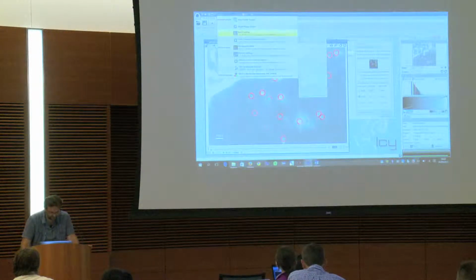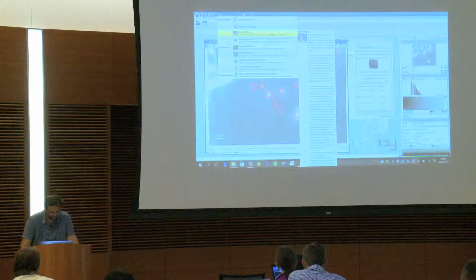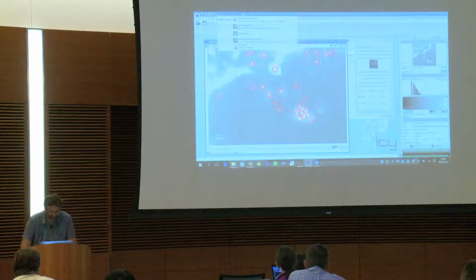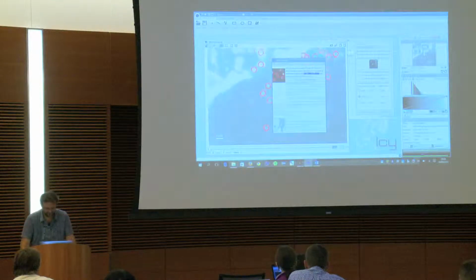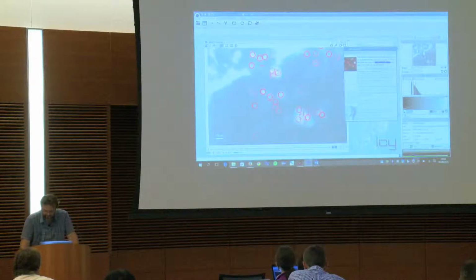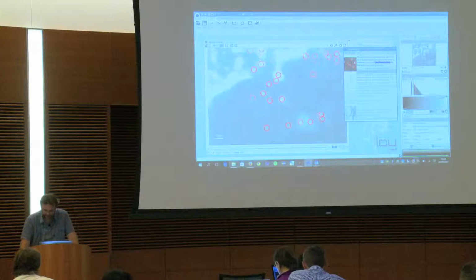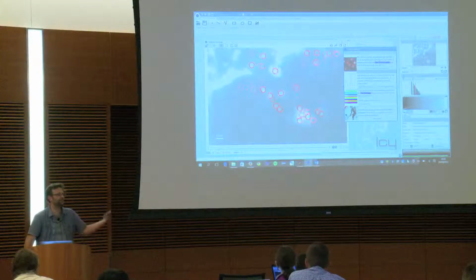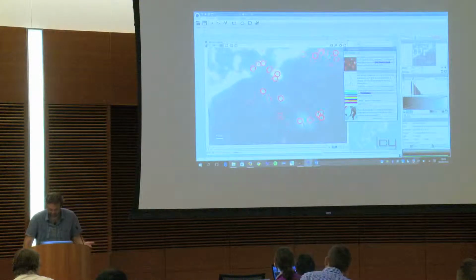So we have a lot of different trackers, so I need to find the proper one. I don't remember, spot tracking, it was obvious. Okay. So here I say that I want to work with my last set because the swimming pool is always accumulating the different results that I have.